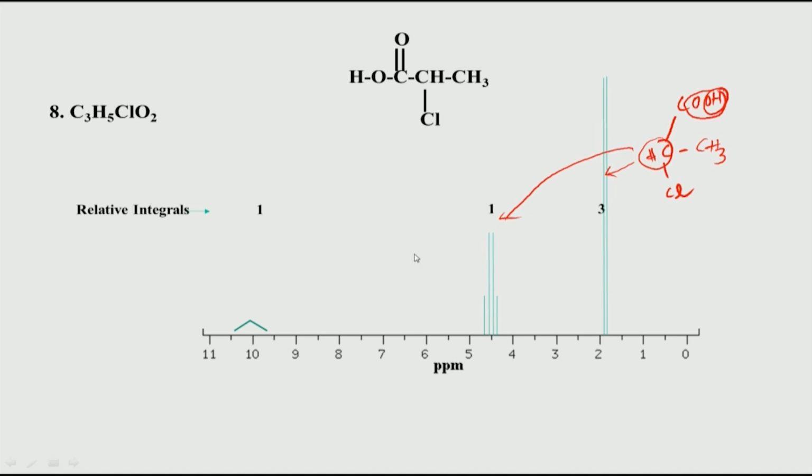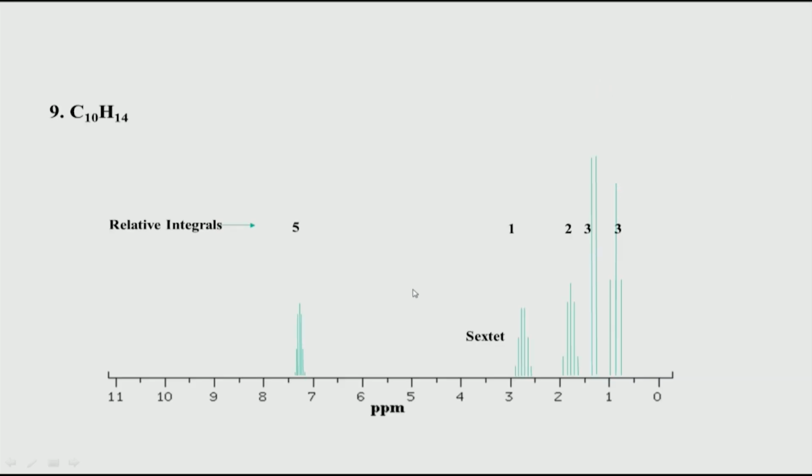So, now in the next two examples we will look at aromatic groups. We have not analyzed the aromatic systems till now; these have all been aliphatic with different functional groups. Now, let us see what happens in the case of aromatics. So, there are different ways to figure this out. This is the molecular formula which we are going to look at for the composition. Now, first thing is, how do you know there is an aromatic ring here?